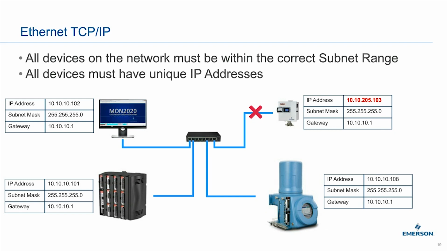A question here, are all Ethernet and serial settings retained in a power loss event? Yeah, definitely. Everything is stored in non-volatile memory because we know power gets switched off on these GCs, and so we definitely don't want you having to go back and reconfigure the unit once the power has been taken off.